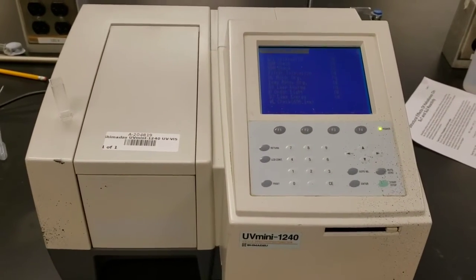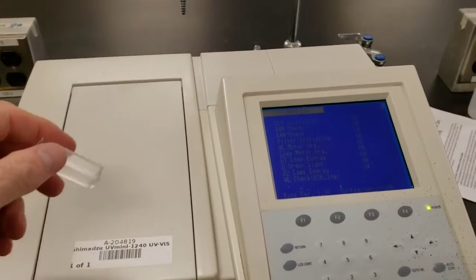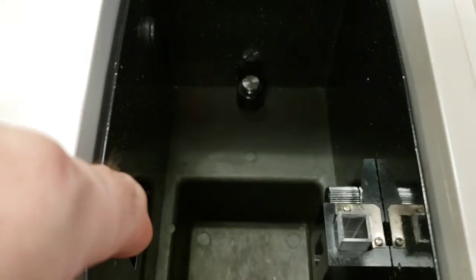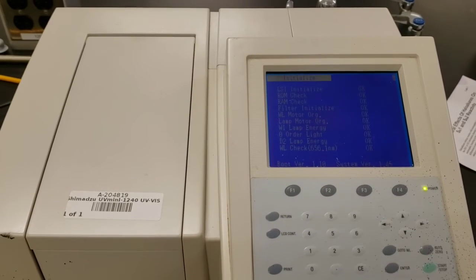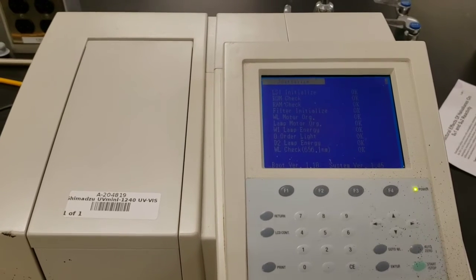This is a spectrophotometer from the late 20th century. You take a solution as your sample and you place it in a sample holder, and a beam of light runs through the sample, and then we analyze how much of that light is absorbed. An instrument like this can read light in the visible spectrum, but also in the invisible ultraviolet spectrum.